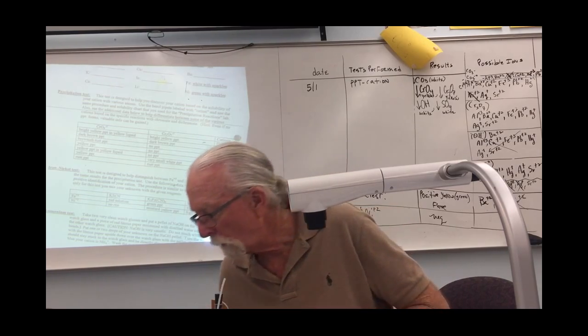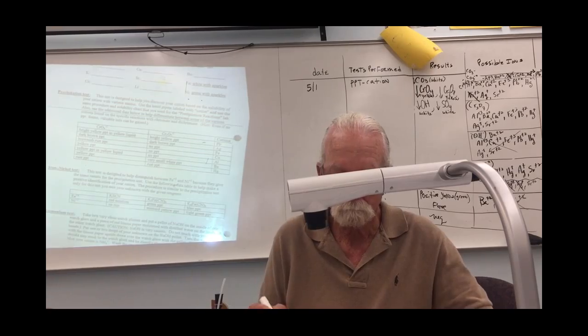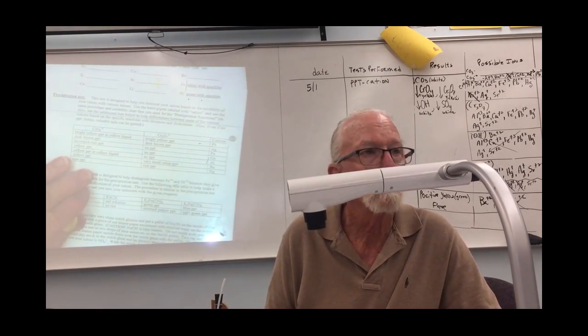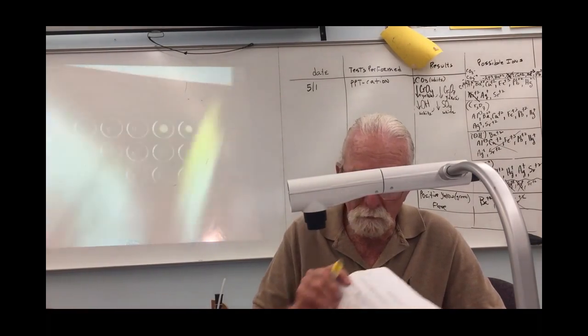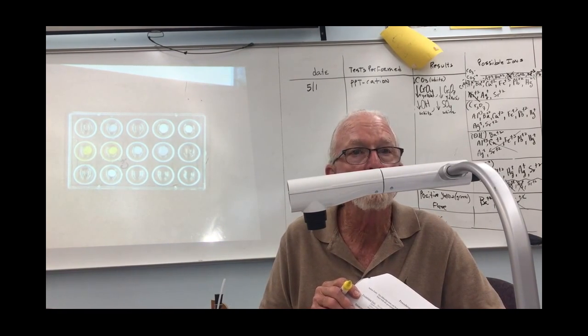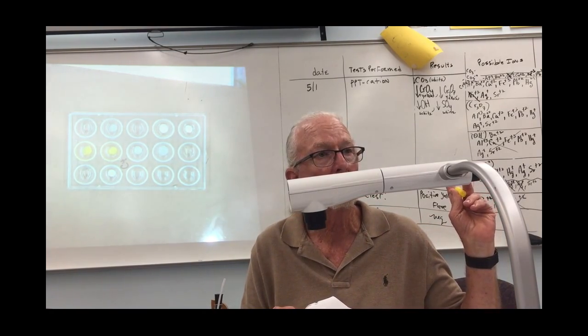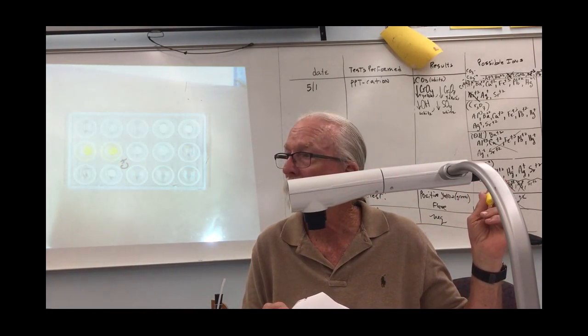What's the only one in that chart? And we notice, we look here. We got yellows and whites, right? So let's take our first one. What's the first possibility of those 5? Barium.